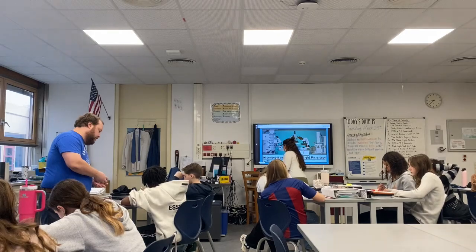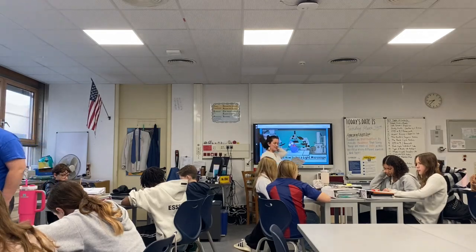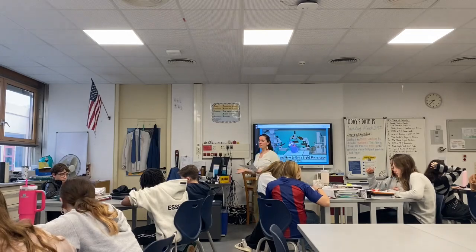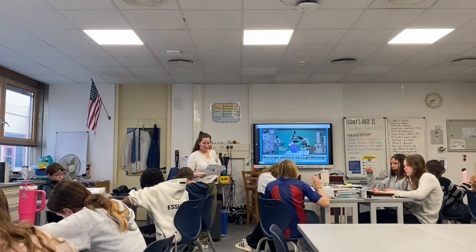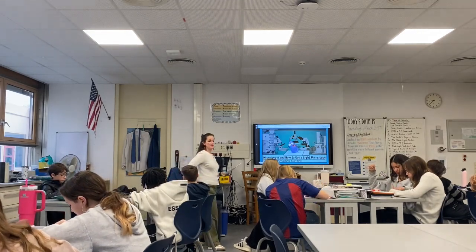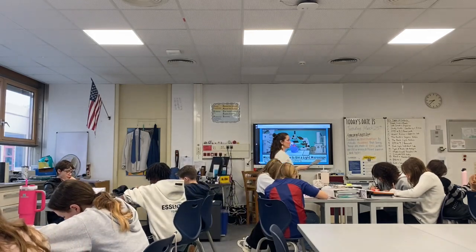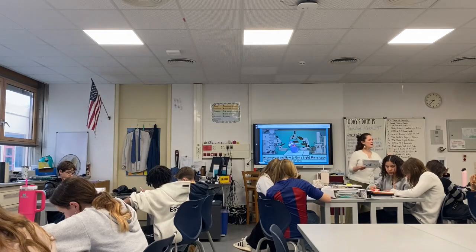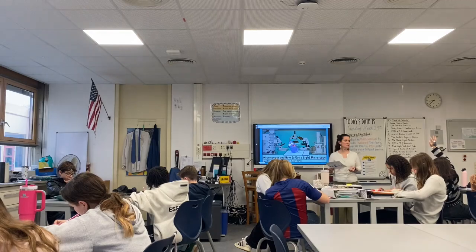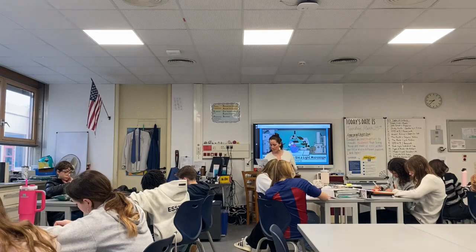All right, quick true and false on the back. Follow the procedure for a wet mount to avoid air bubbles because they can be mistaken for a specimen. True or false? True, right? We want to avoid air bubbles, and we'll look at that in a minute. The pointer that you see in view can typically be rotated by rotating the eyepiece. True or false? That was true. You will not have one on your microscope though. If the lens needs to be cleaned, do we use tissue paper? No. False. We don't want to use tissue paper on the lens. There's special paper that we can use.